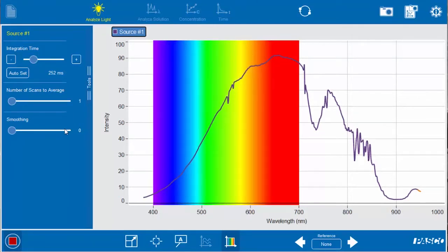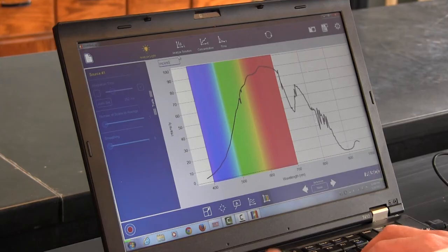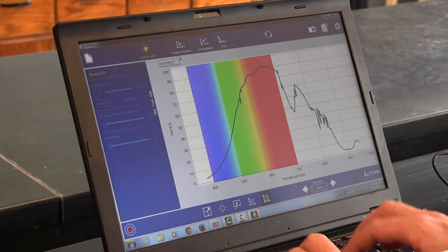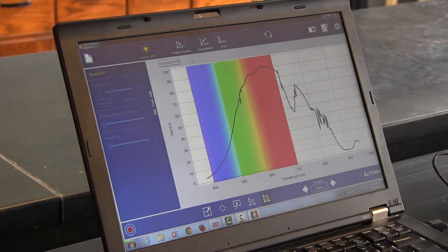So there is the spectrum. After you finish taking the spectrum, you just press stop and your data is automatically saved. It's called source 1 right now, but if we click on that and click the pen, we have the option to rewrite and we'll call that incandescent for an incandescent light bulb.